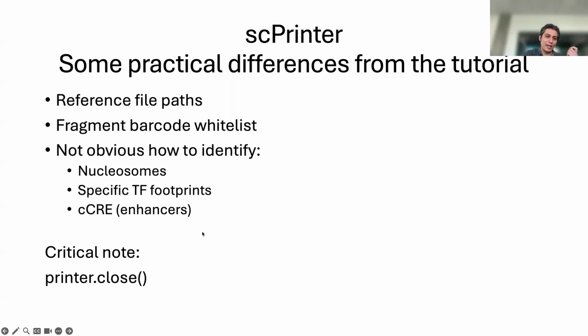And then the last one here, candidate cis regulatory element analysis. So essentially, how do you link enhancers, and potentially even the transcription factors that are binding to enhancer regions, to this multiscale analysis? I do believe that there's a way. The paper definitely includes a way, but the specific code to do so isn't inherently clear from the tutorial. Although I'm betting it's somewhere in the functions, or even a function to come, that they had ready for the paper, but not necessarily for their documentation.